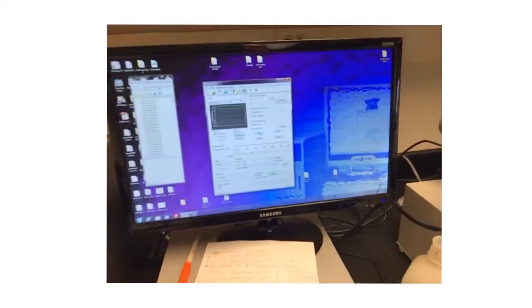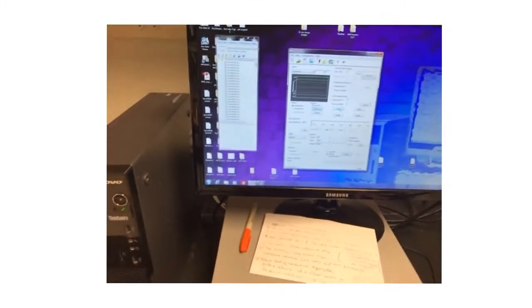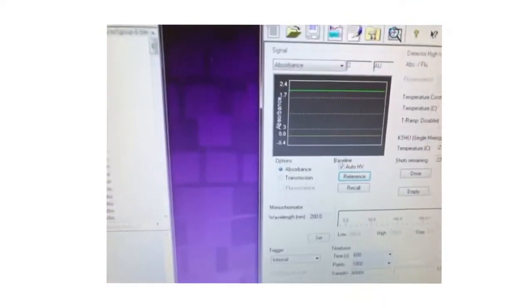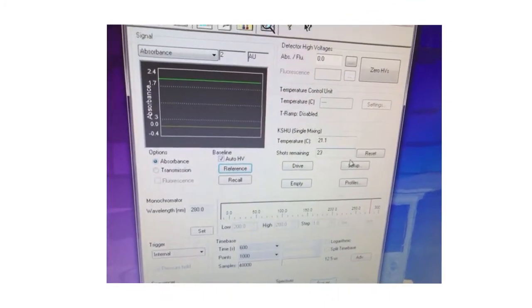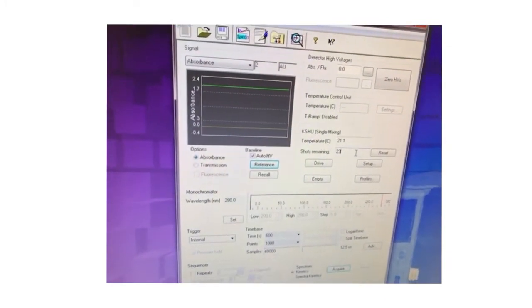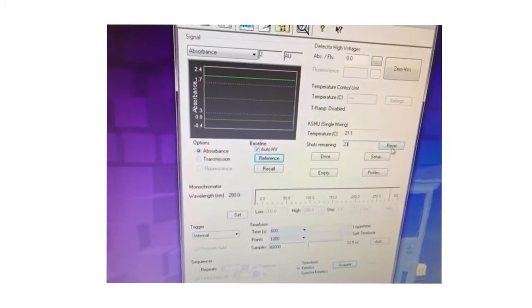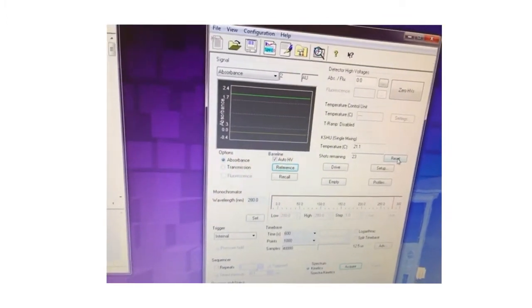Now, usually I don't use the drive mechanism. I'll show you a manual way to do this quicker. But if you notice the shots remaining, if I zoom in here. Shots remaining. Every time I hit drive, once it's full, I only have about 25 total shots with the entire syringes full. And rarely do we use the drive mechanism. Sometimes we do. Sometimes you need to hit this reset button. So whenever you refill, you just hit the reset button.